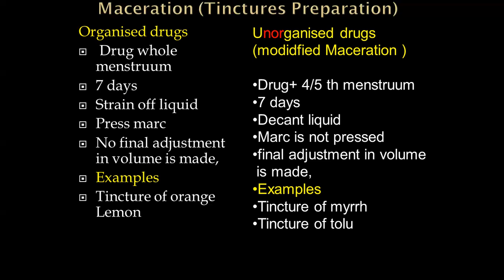Even if you press, the resins and gums start coming out through the filter and affect our final preparation. So without pressing the marc, you can get the maximum amount of extract from the resin-based or gum-based, that is, the unorganized drug. And in this case, the final volume can be adjusted.